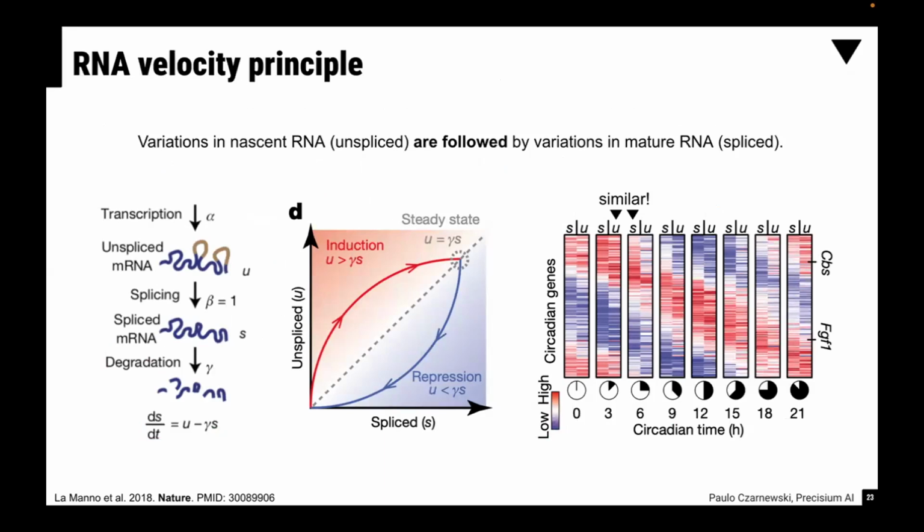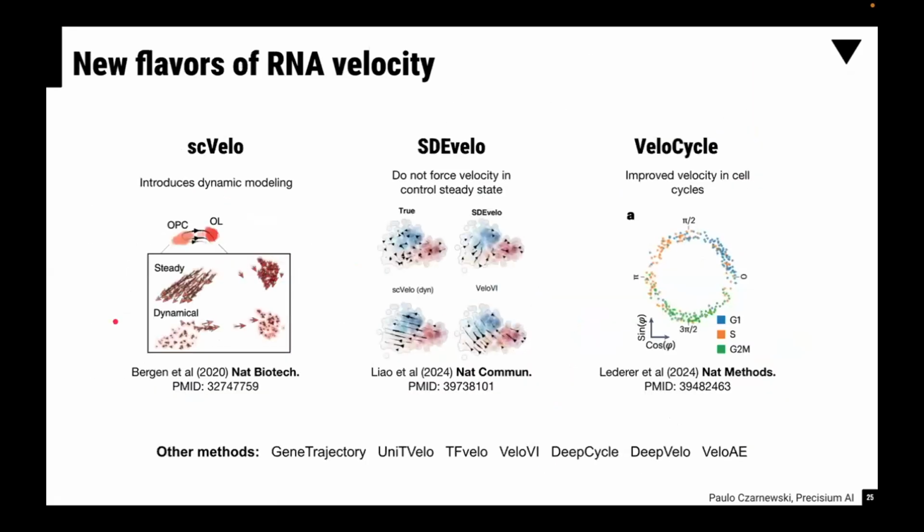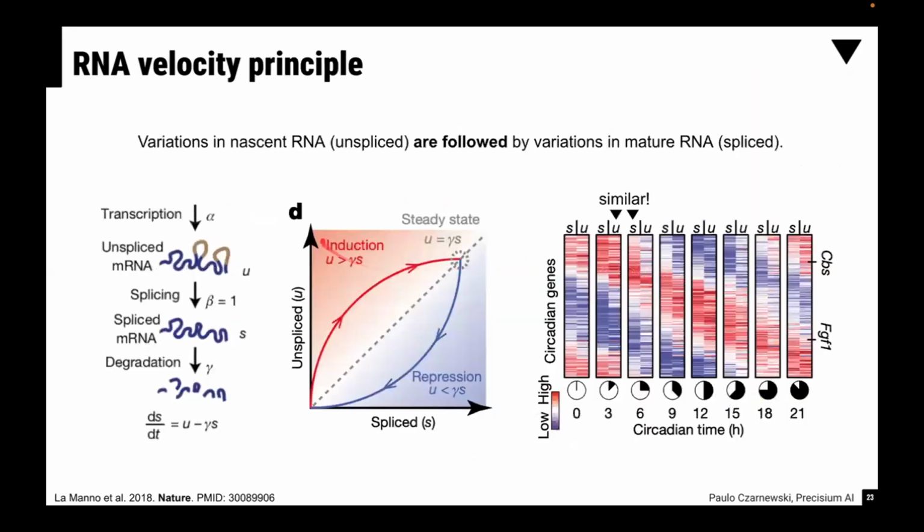Yeah, that is a great question. Most of these packages, this is the first model, so it was quite simplistic. Other types of tools try to model that a little bit differently, adding, for example, other types of degradation rates or even microRNAs or trying to inhibit with siRNAs, because as you mentioned, this process is not always straightforward.